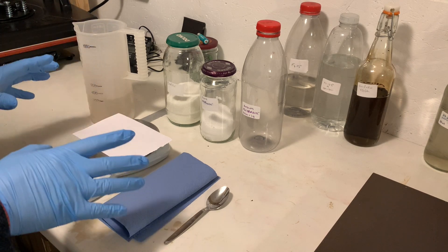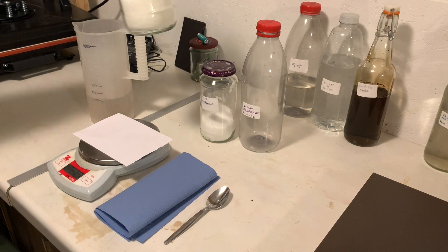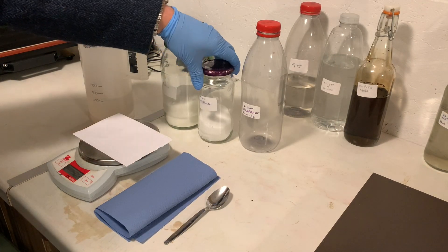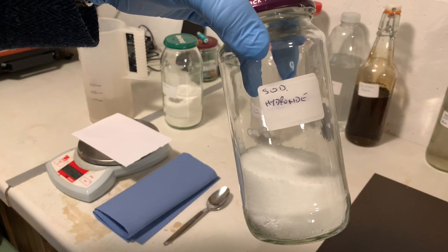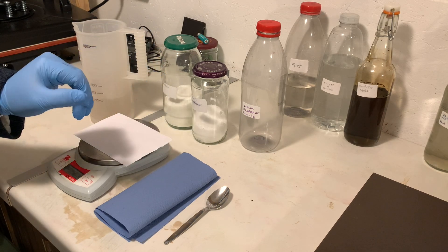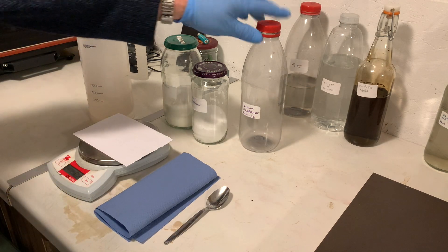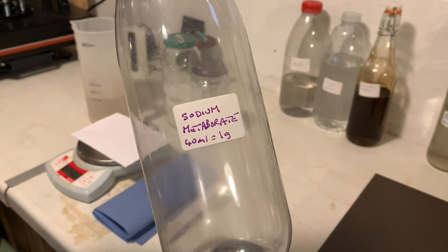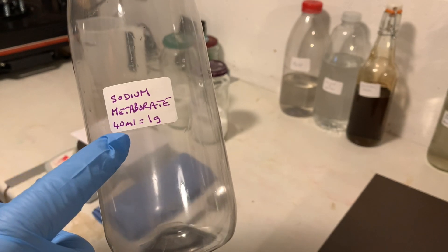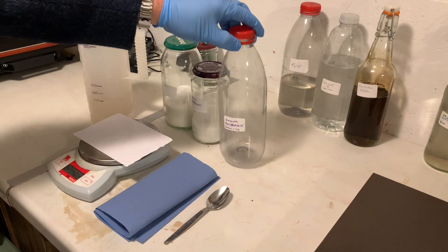Making sodium metaborate is not a difficult thing. You'll need warm water — not hot, just warm. You need borax, which I buy on eBay in bulk, and you'll need sodium hydroxide, or drain cleaner, which is very easy to get hold of. Now, in the right proportions, these two mixed together make sodium metaborate. I've got my scales ready and a bottle ready to put the sodium metaborate in, labelled with how much of the mixture will make one gram of sodium metaborate.